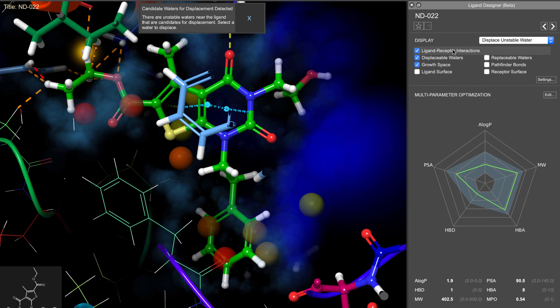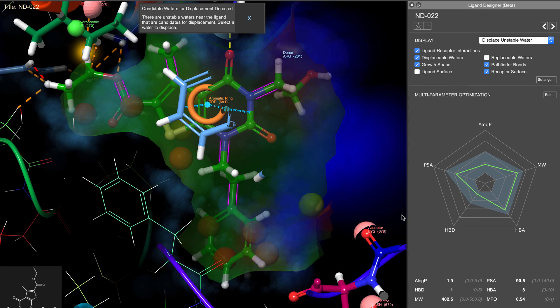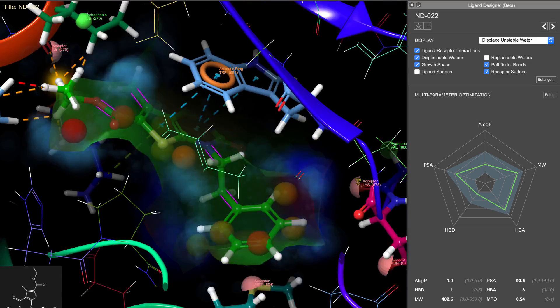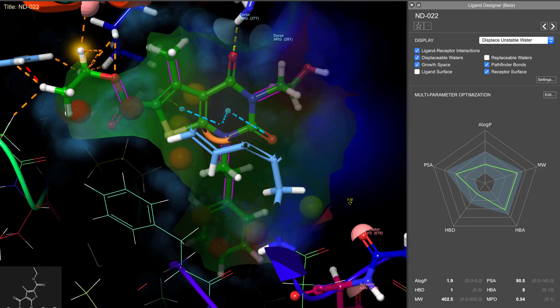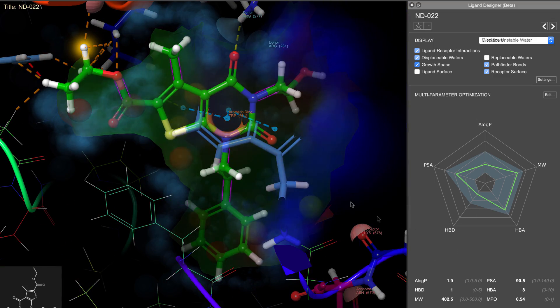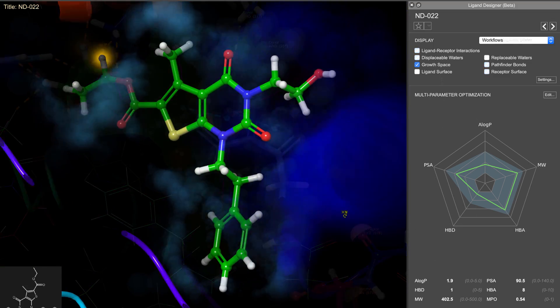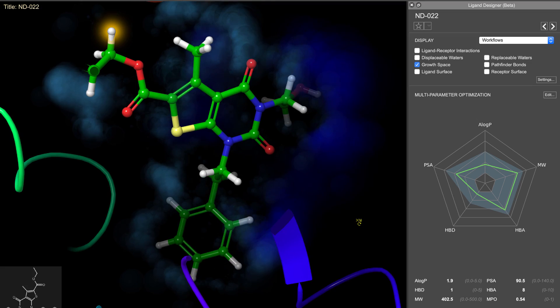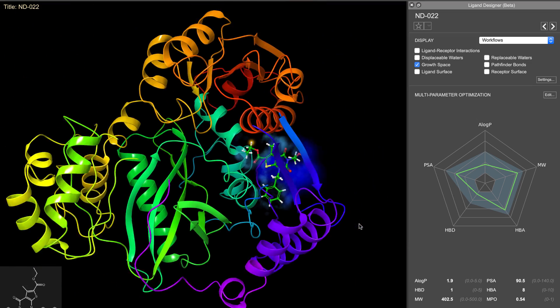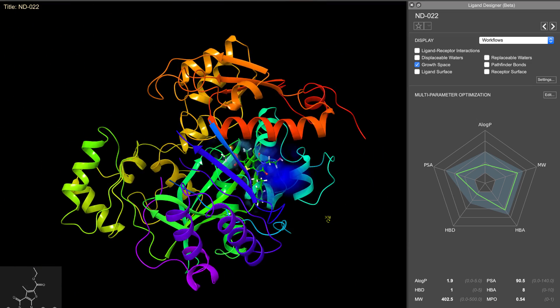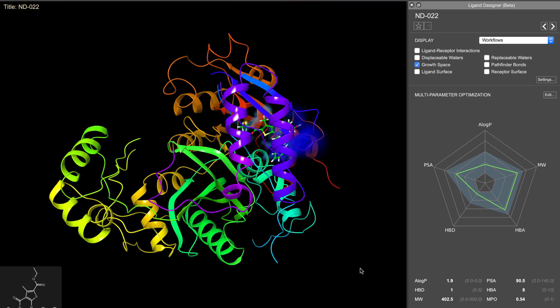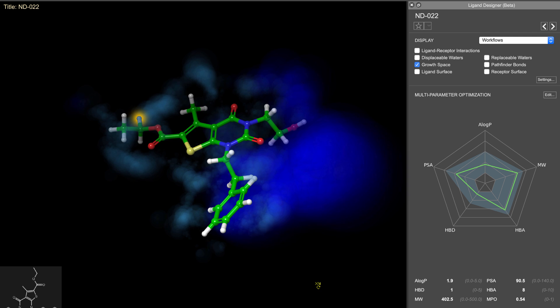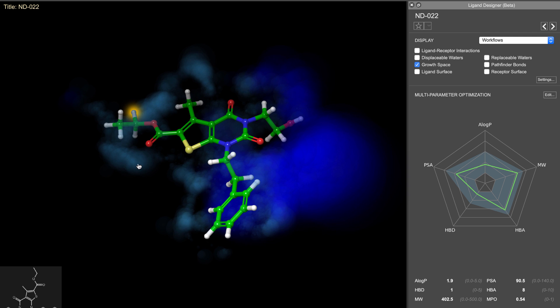The ligand designer allows users to overlay new information about the ligand's surroundings in the binding site. For example, here we see the growth space, which shows where there is space between the ligand and the receptor, and whether it's buried in light blue or solvent exposed in darker blue.